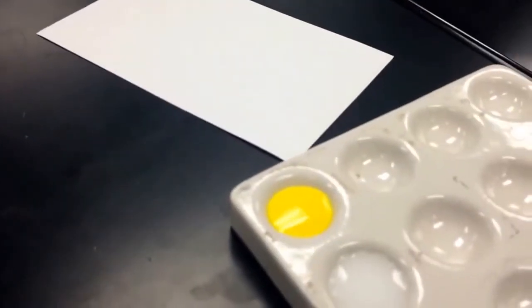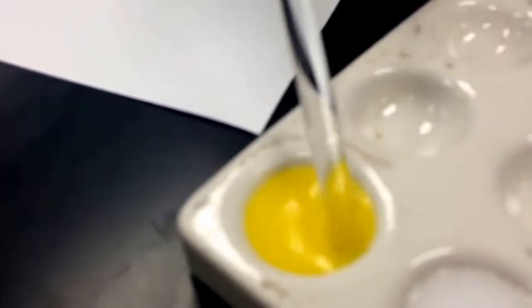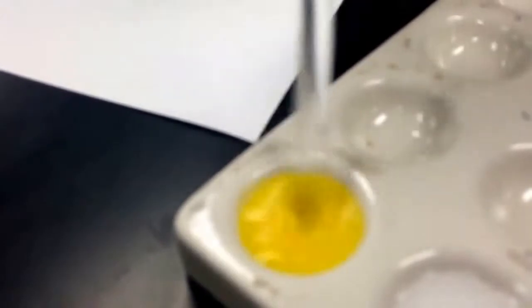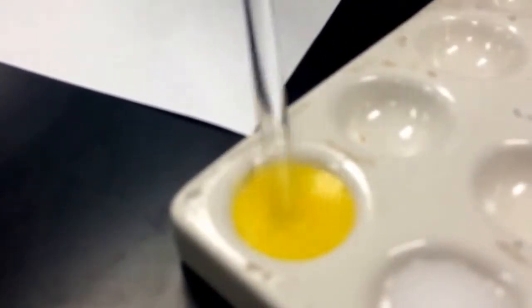And this time you see a yellowish tint. And there's small yellow precipitate. They're not clumped up like in the previous one, the silver nitrate and sodium chloride, but they're there. Very small.